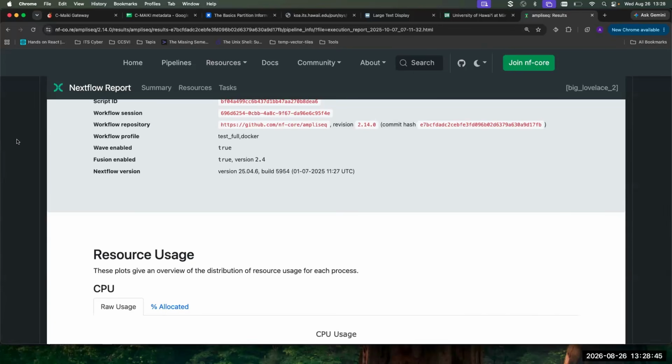Yeah, that's a great question. To more broadly say what Maggie's asking, a lot of times you open up a pipeline and we have default parameters, specifically with length trimming. Those default parameters come from the community, generally what people use, and also from our experience, and they're pretty good defaults. But who knows, maybe your sequencing run was especially bad or especially good, and maybe you want to adjust those parameters. How do you adjust them?